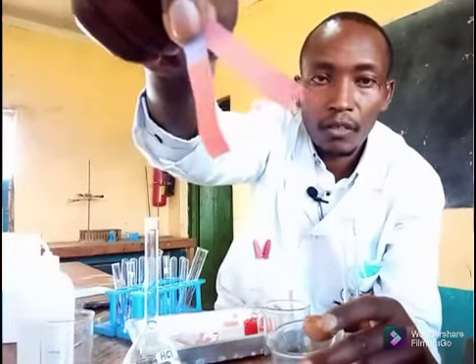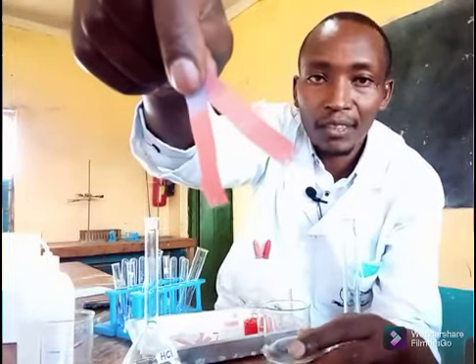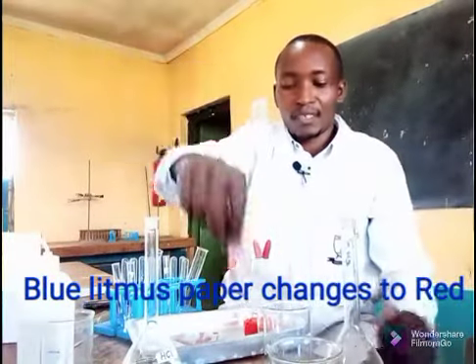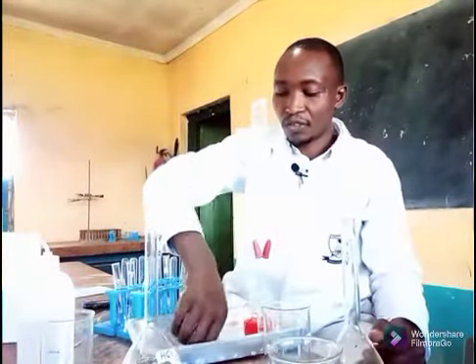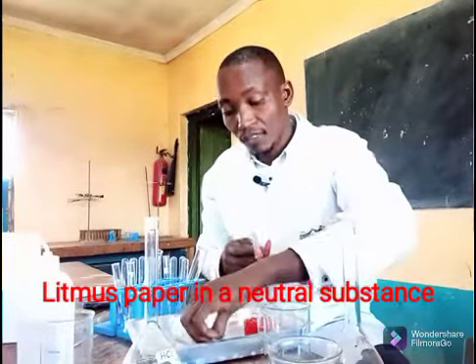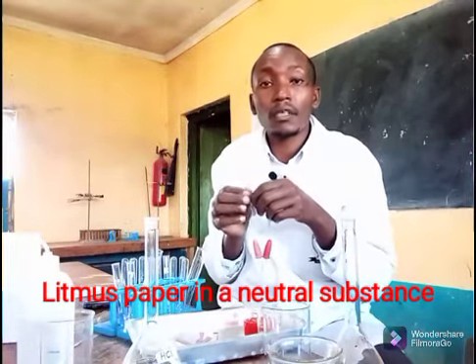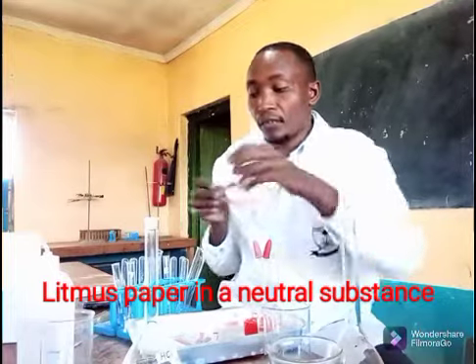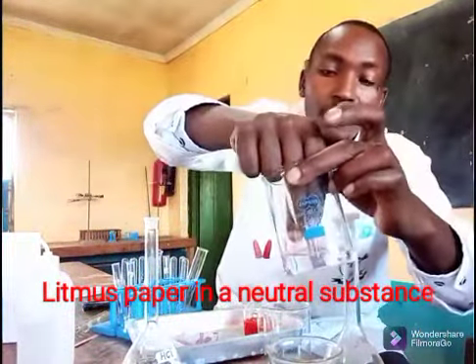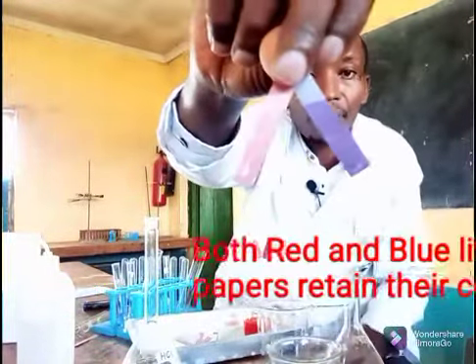No magic. The red litmus paper has remained red. The blue litmus paper has assumed the red color. Then finally, I'm going to have the litmus paper in a neutral solution, or a neutral substance, that is distilled water. And when I do that, I will lower them, then I will compare.